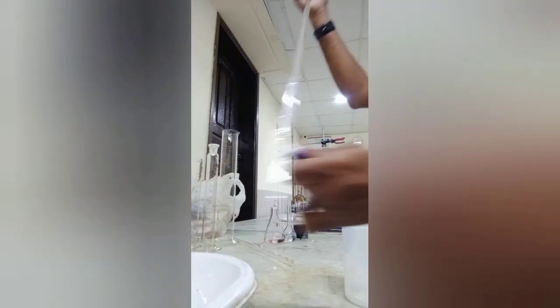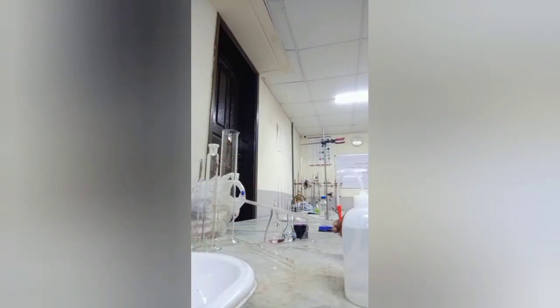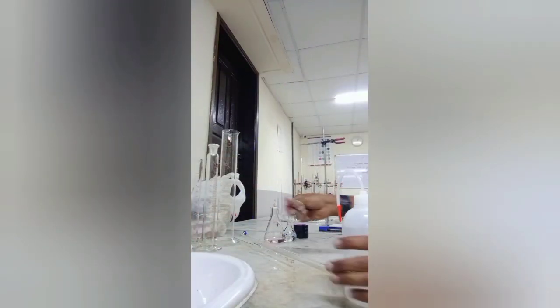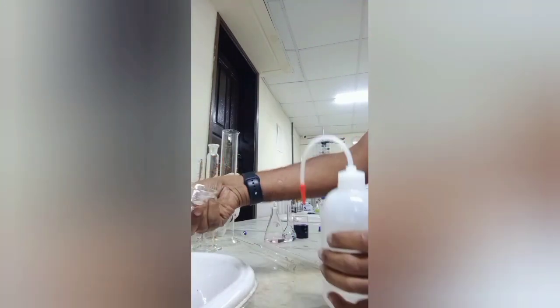Then you can open this side by rotating. Okay, like this you want to do two times. This is the way of washing. Funnel, the same thing. Every time use the wash bottle. If water is not there, fill the wash bottle with water. It will be good for you to wash it very easily.